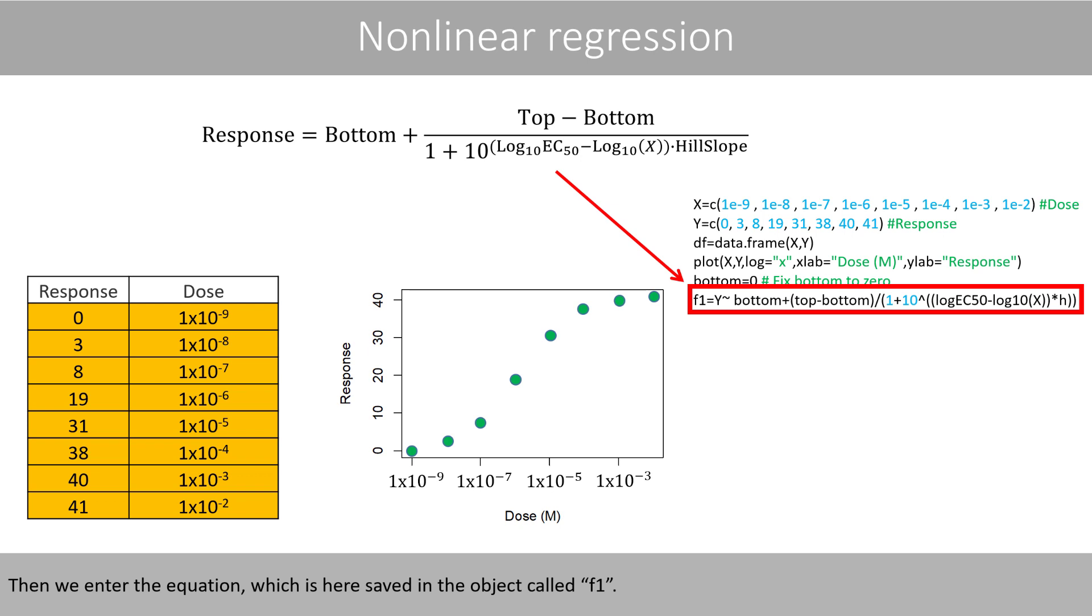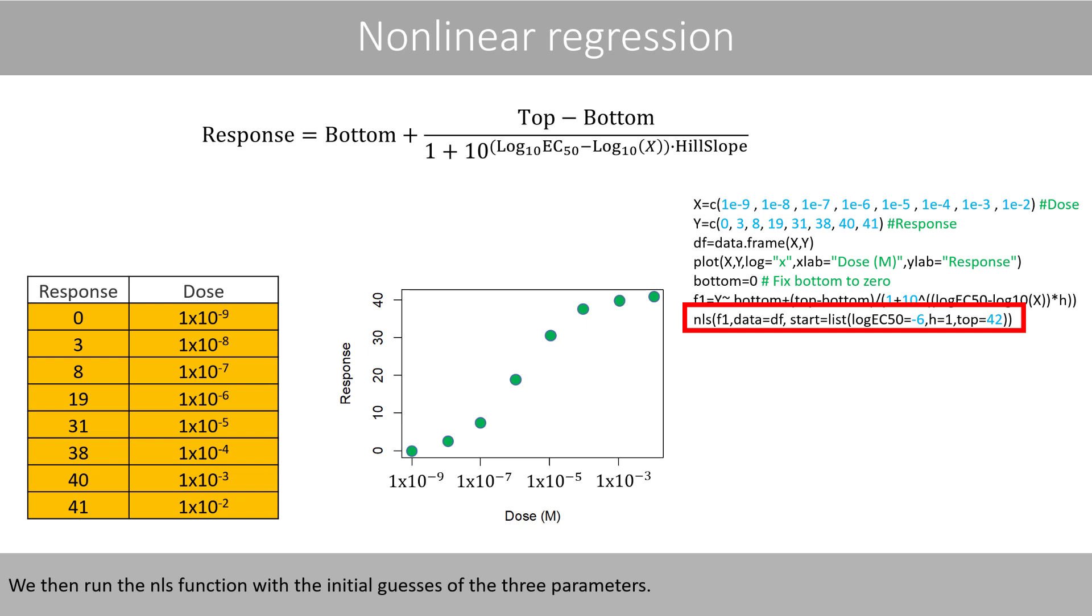Then we enter the equation, which is here saved in the object called F1. We then run the NLS function with the initial guesses of the three parameters. Note that the parameter bottom should not be included in this list, because we will here not estimate that parameter.